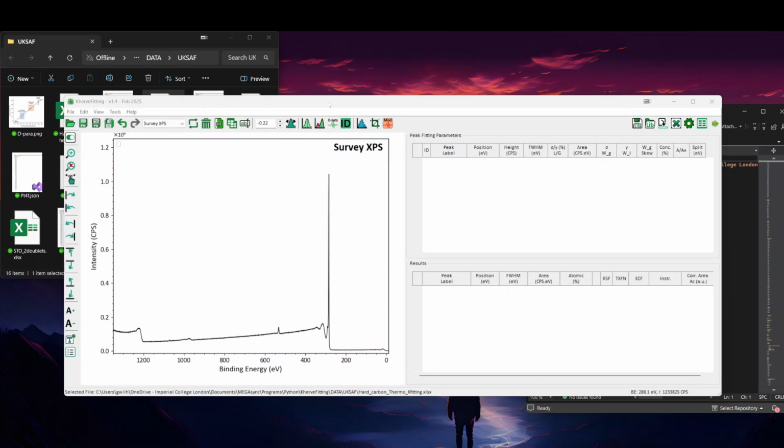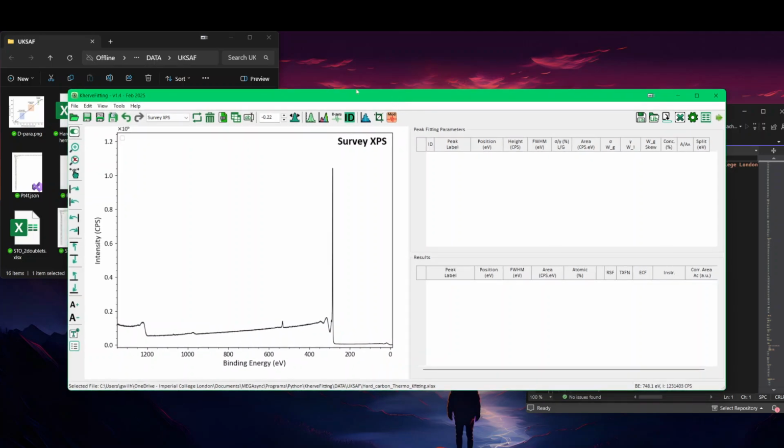This video is about KherveFitting version 1.4 and is targeted at users who have used the software before and want to know the little tips and tricks of the software. So I will start by looking at the survey.